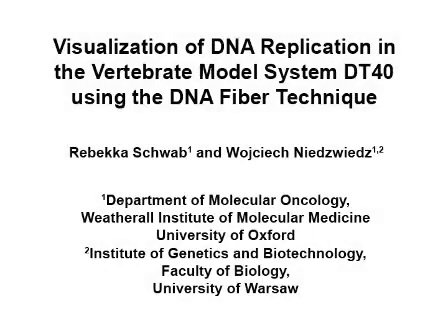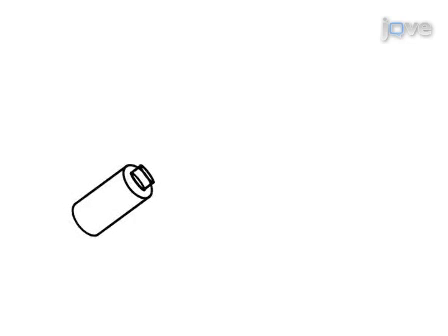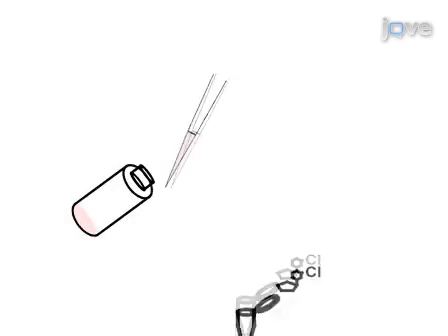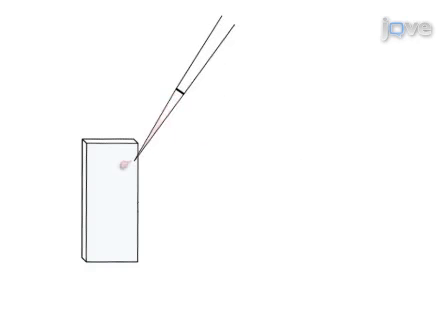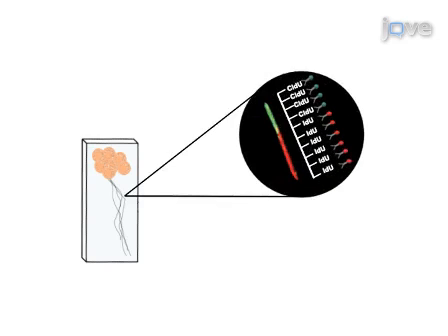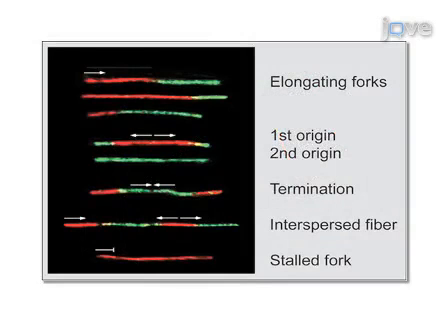The overall goal of this procedure is to visualize DNA replication on the single molecule level. Begin by incorporating halogenated nucleotide analogs into newly synthesized DNA in living cells. Spot the cells with labeled DNA onto a microscope slide, then lyse the cells and stretch out the DNA. Subsequent immunostaining of DNA fibers and analysis of the fluorescent microscopy images can illuminate the global replication fork dynamics to allow quantitative analysis of parameters that influence the overall replication program.